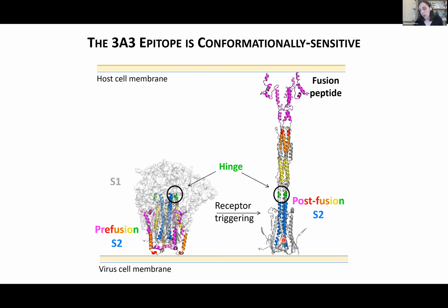So we really have identified a potential epitope here that can be used for a pan-coronavirus therapy. So the S2 apex may be a vulnerable site for pan-coronavirus neutralizing antibodies, but I guess more generally, HDX can be used to rapidly screen for antibody epitopes. Again, before I jump into my next application, I'd love to open to the floor for questions.